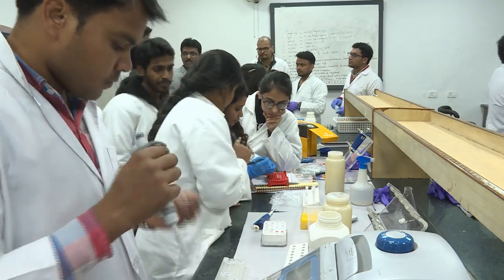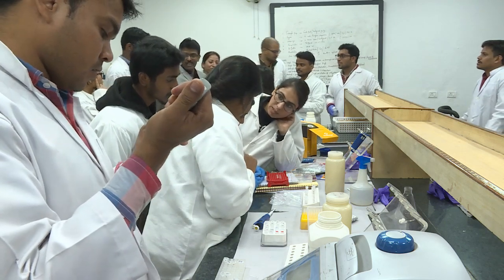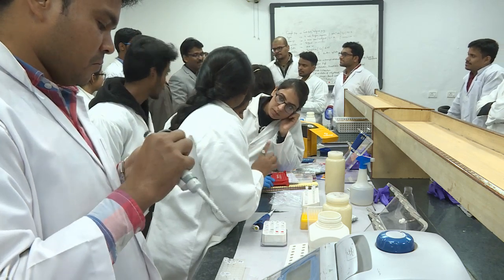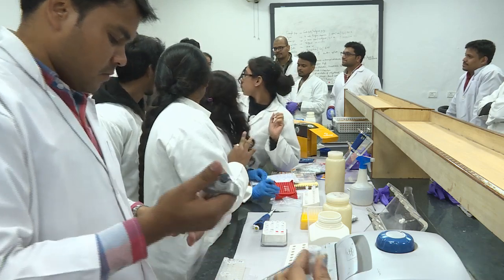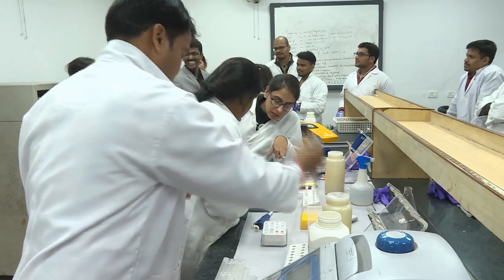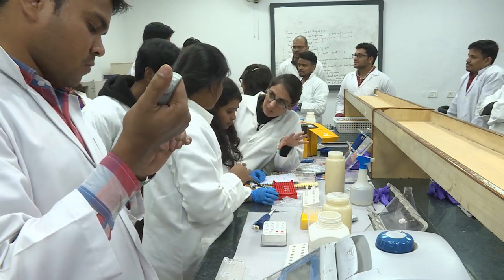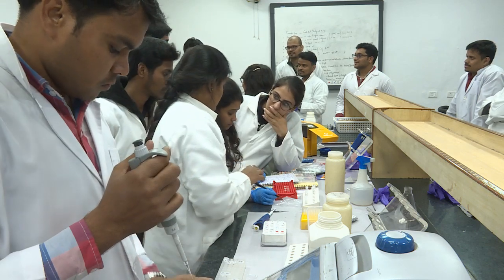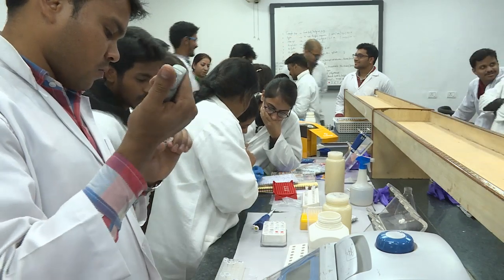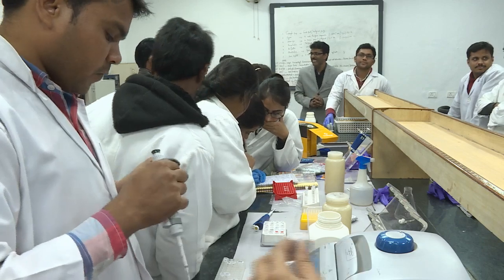So we have different kinds of experience, right? Diluted one, undiluted one, poorly handled samples, nicely handled samples, kit, laboratory, one stop, everything is there. Use this one directly. Choice of the biological material, how much content we may go wrong with. So 100 nanogram is the ideal.